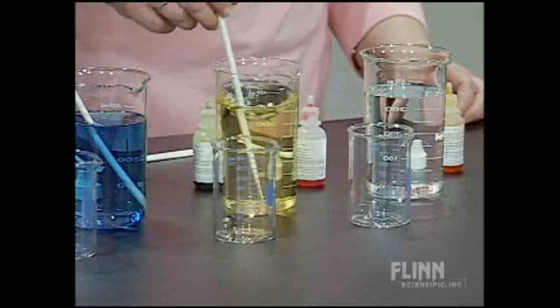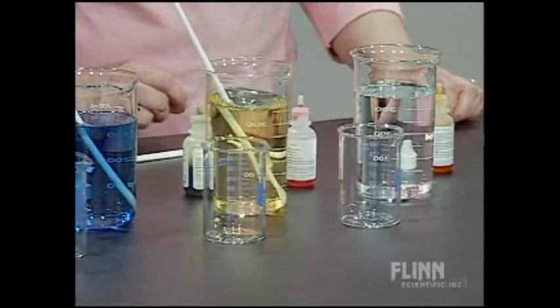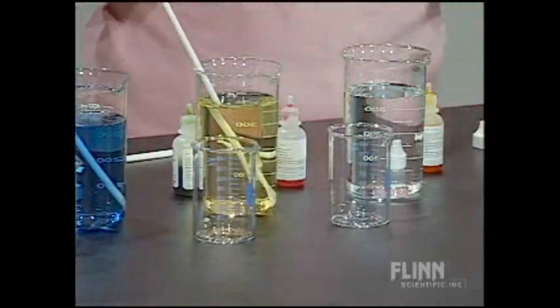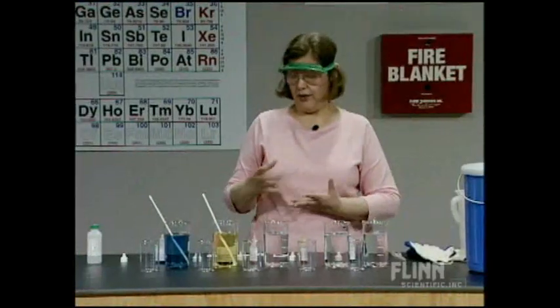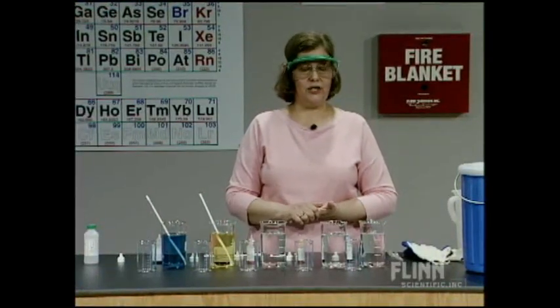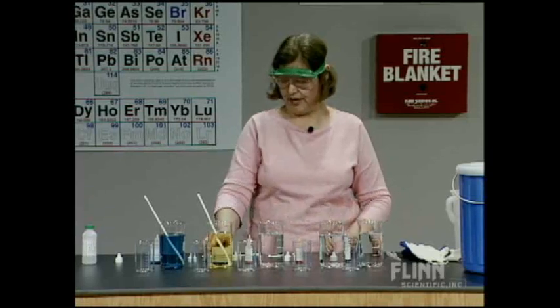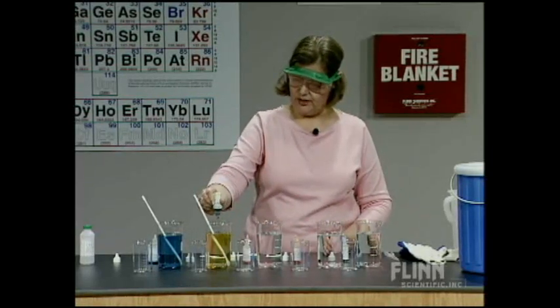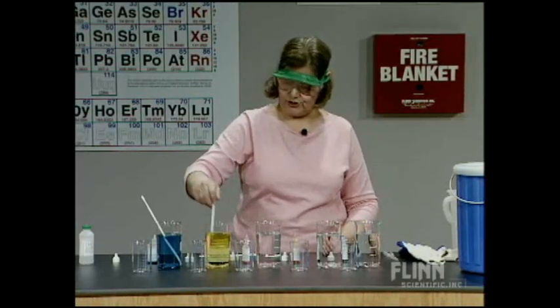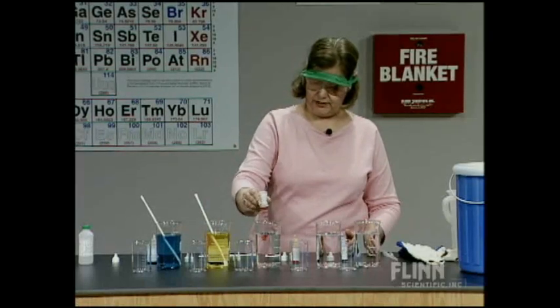I have a yellow solution there, which is universal indicator. Universal indicator is a different color at each pH value. At yellow, that corresponds to a pH of about 6. I'm going to add a little bit more there just so that we have some nice, deep, rich red colors.